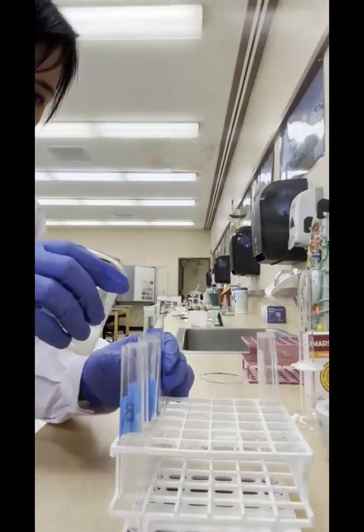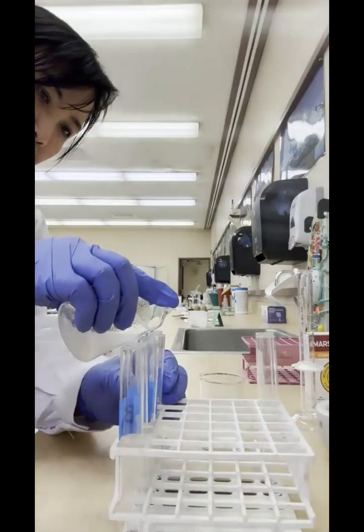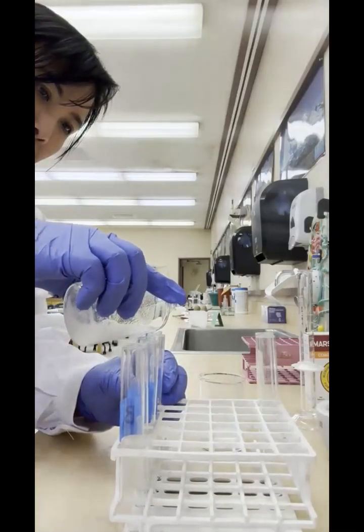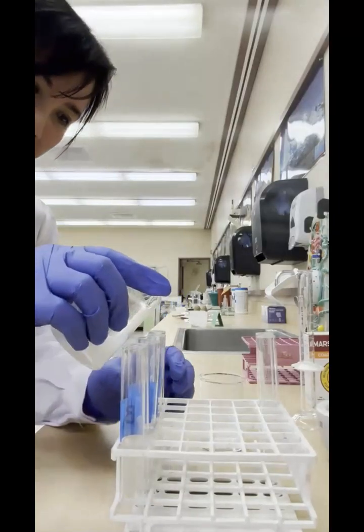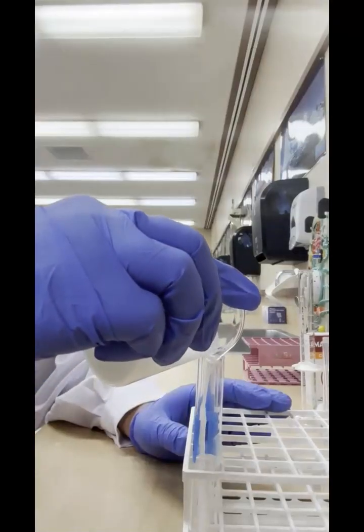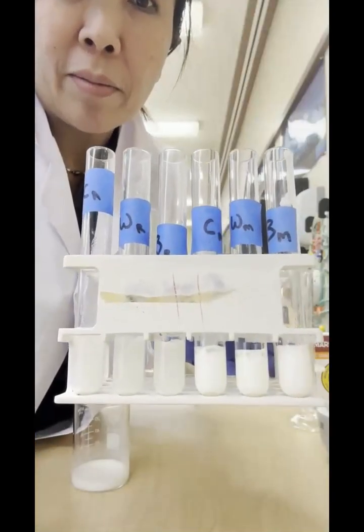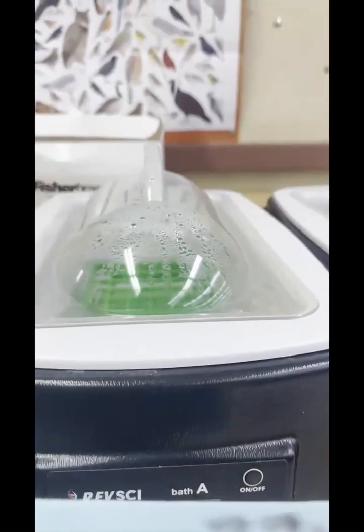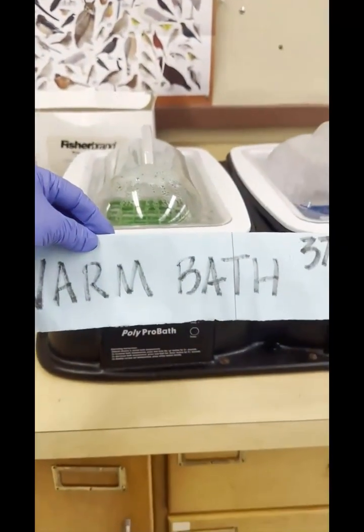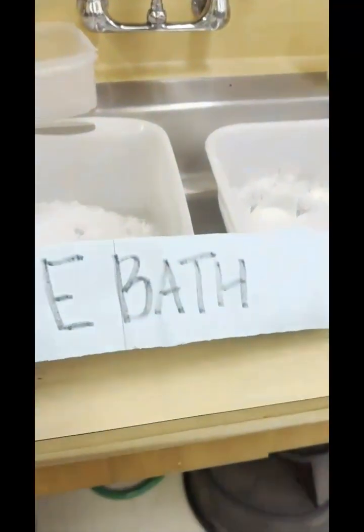Let's switch it around and add to our different water baths. This is our warm water bath at 37. You can see that's our ice bath.